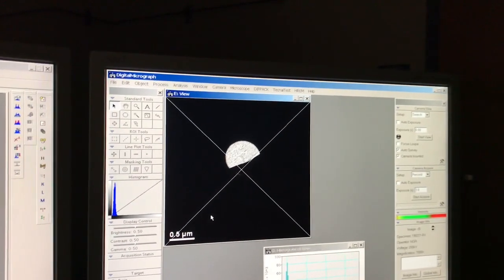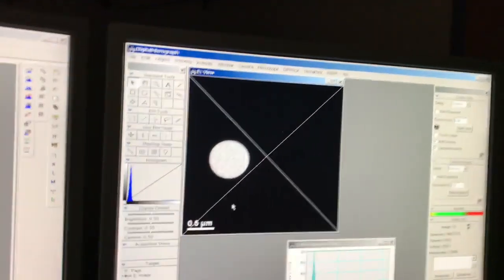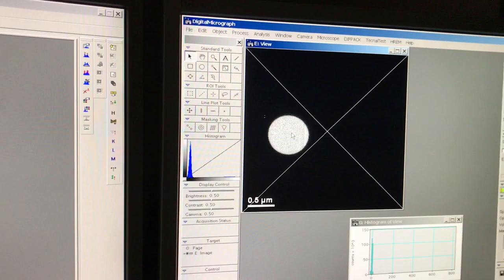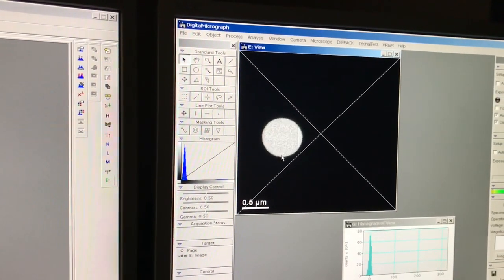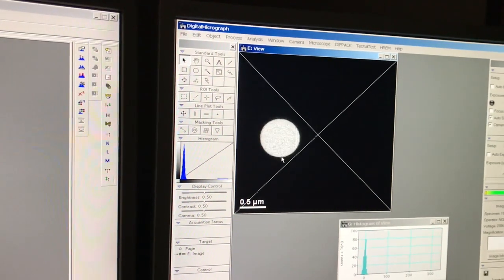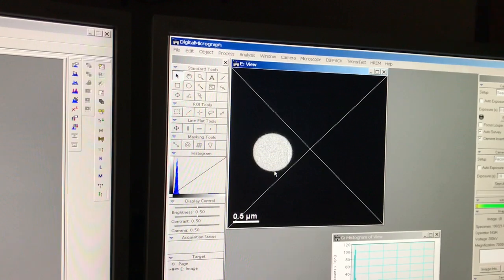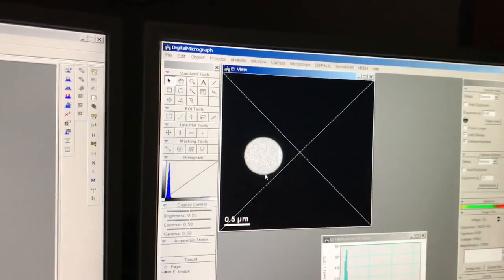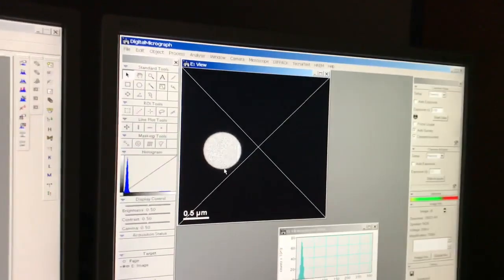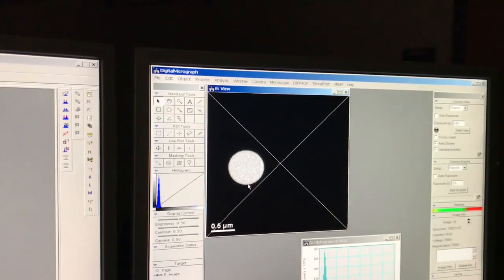So I'm going to shift the, okay, so there you can see, I don't know how big this is. You could measure this really easily. It looks to be, just eyeballing it, a diameter of about 0.75 microns. Okay, so that's the contributing area to the pattern.